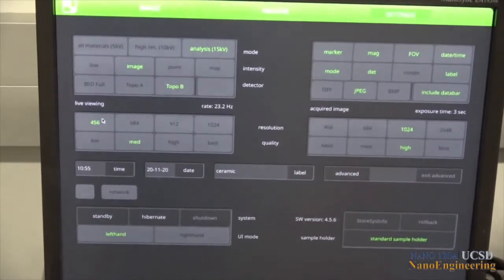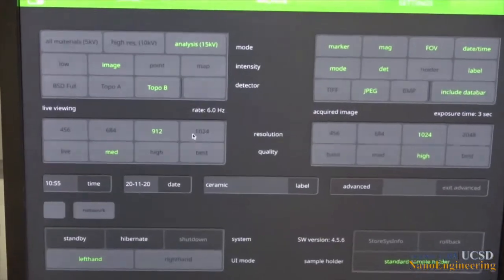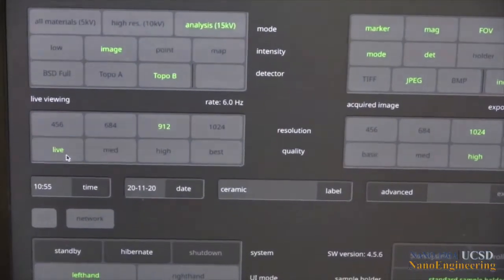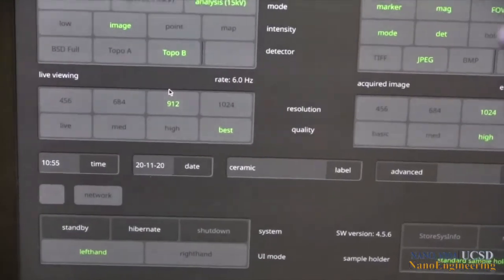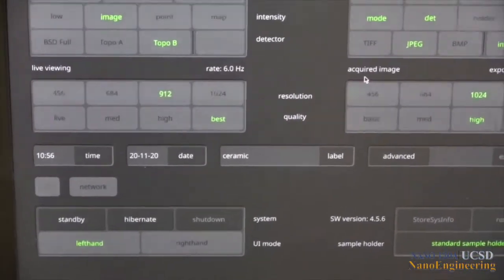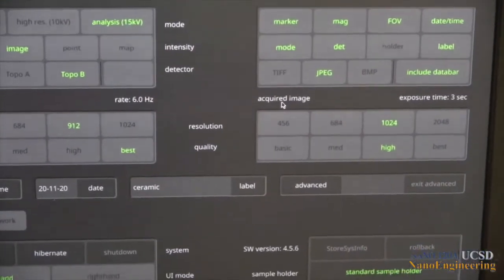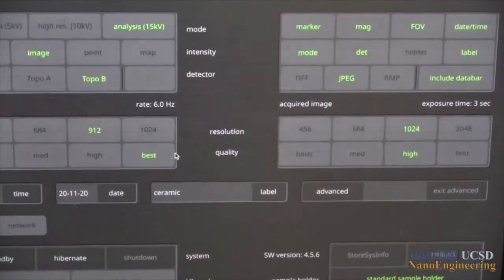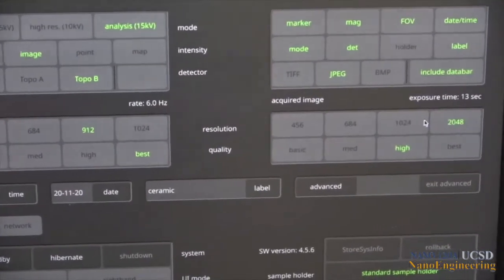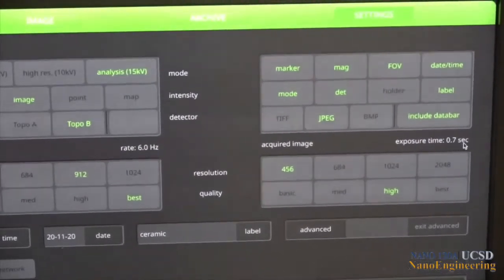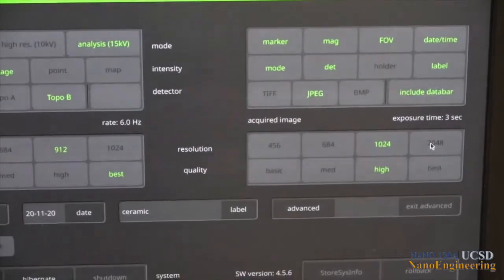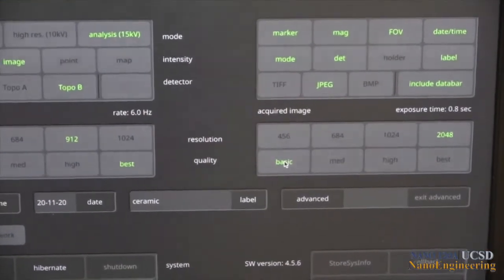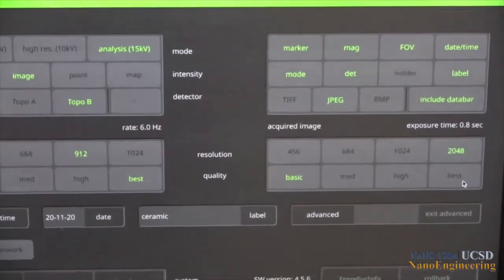The live viewing boxes have resolution and quality controls as shown here. You can set the resolution, the noise level, and response speed—that is the refresh rates for the image that appears on your viewing screen. Higher numbers typically result in slower rates of refresh and better image quality. Similar settings are available for the recorded image or the acquired image during picture taking. As noted here, higher values of resolution and quality result in longer exposure times as shown.